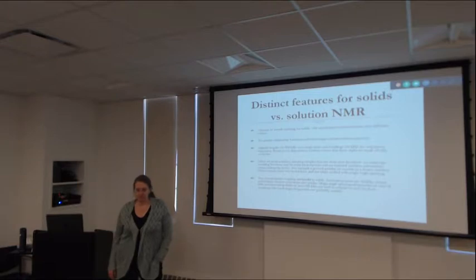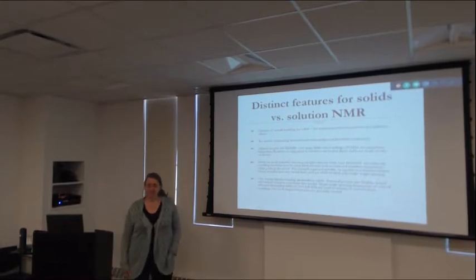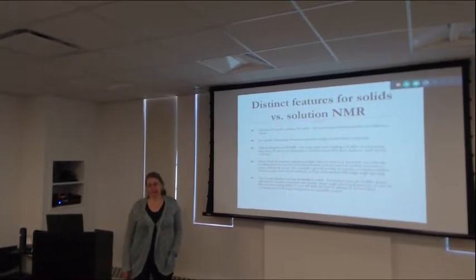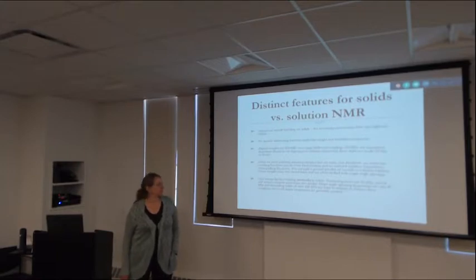And that's where the solution experiments have this advantage, that the tumbling is removing those networks of couplings without you doing anything. With solids, we're going to have to do something in our experimental format to bring pseudo-infinite networks, strong couplings, under control.